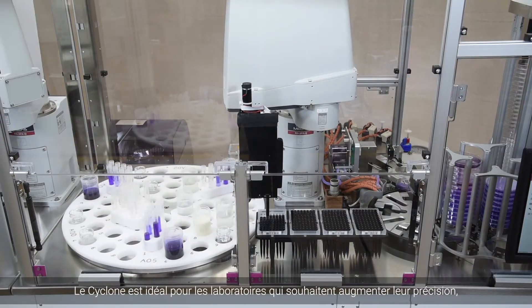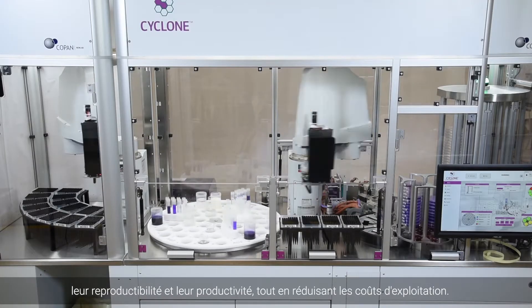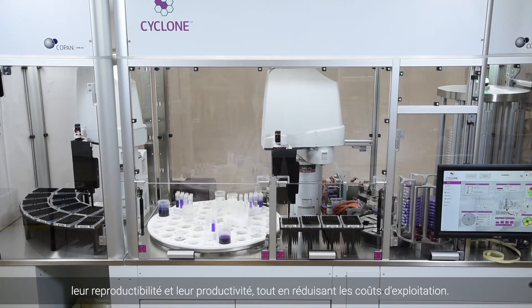Cyclone is ideal for laboratories wanting to increase their accuracy, reproducibility and productivity while also reducing operational costs.